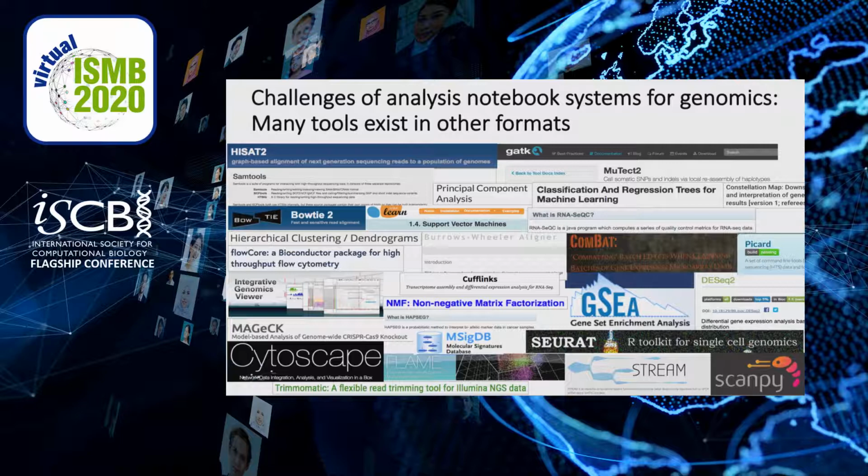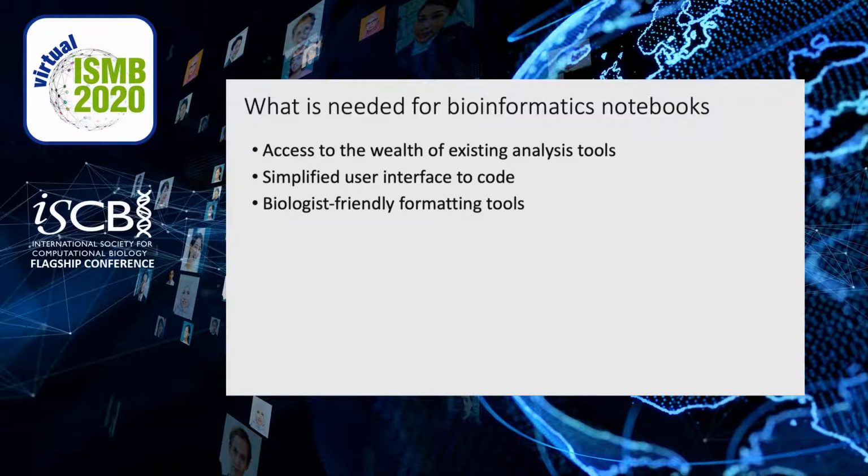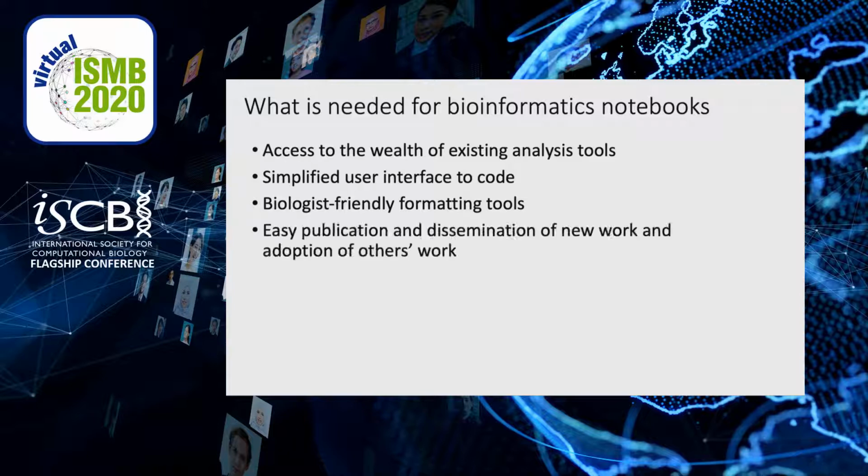To summarize, what we need: easy access to existing analysis tools in a way that doesn't require ongoing maintenance of each tool. An easy way for non-programming scientists to access the methods in notebooks developed by bioinformaticians. Tools that don't require knowledge of a markup language to create richly formatted text.